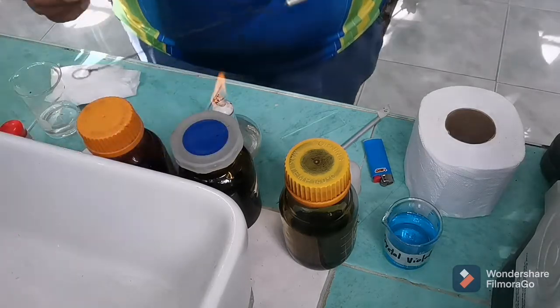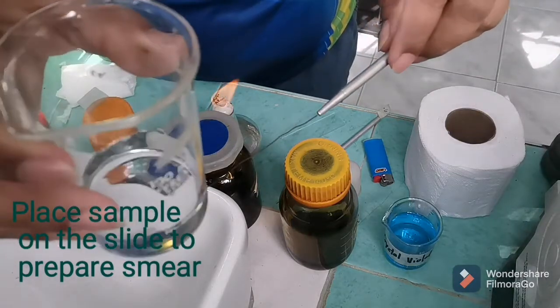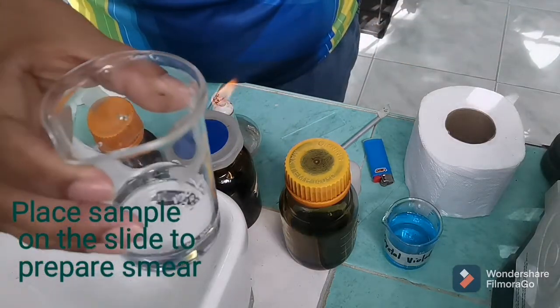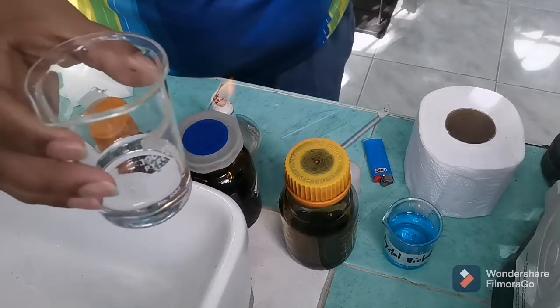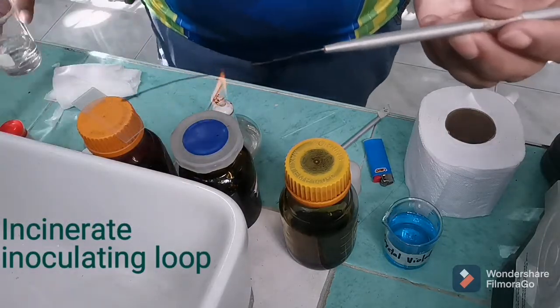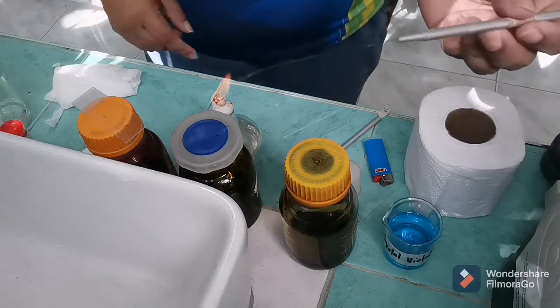Now, where is the microorganism? The microorganism is found in our sample. Now, how to do this is, first I will heat or incinerate this before getting any microorganism.